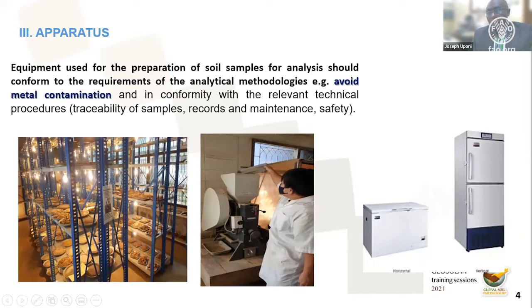Oftentimes we may need some grinders in order to be able to crush the samples, especially some of the harder samples. Clay samples, for instance, are very hard when they are dry. So you need to be able to crush them. The idea here is not to grind them to fine powder as such, but just to loosen them to their loose particles that enable us to be able to sieve them for analysis.